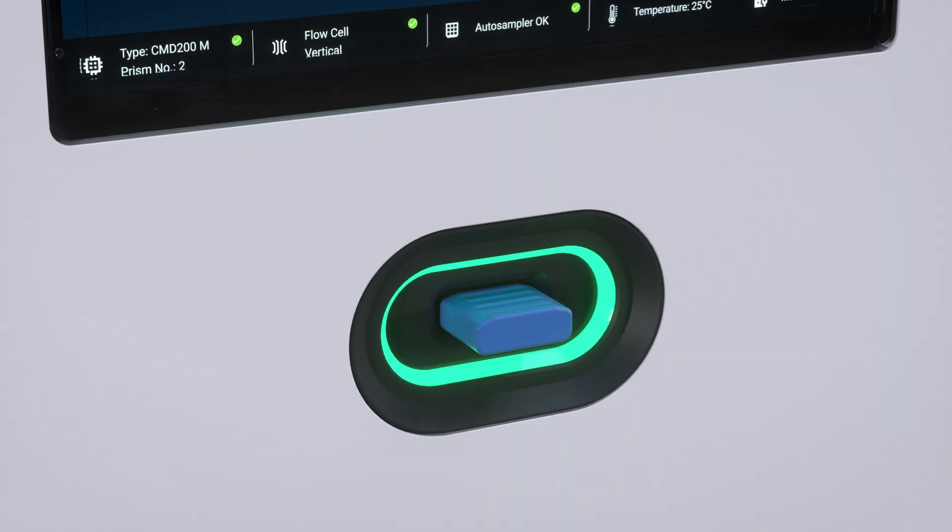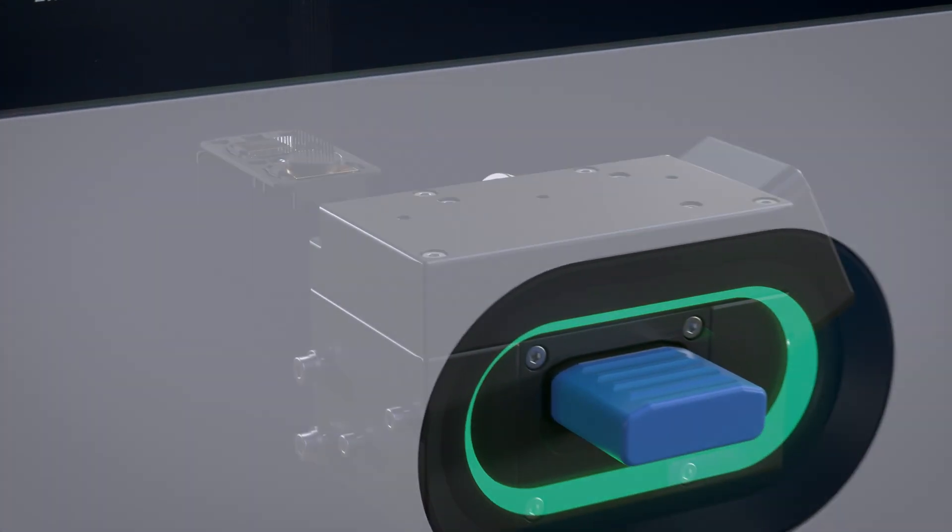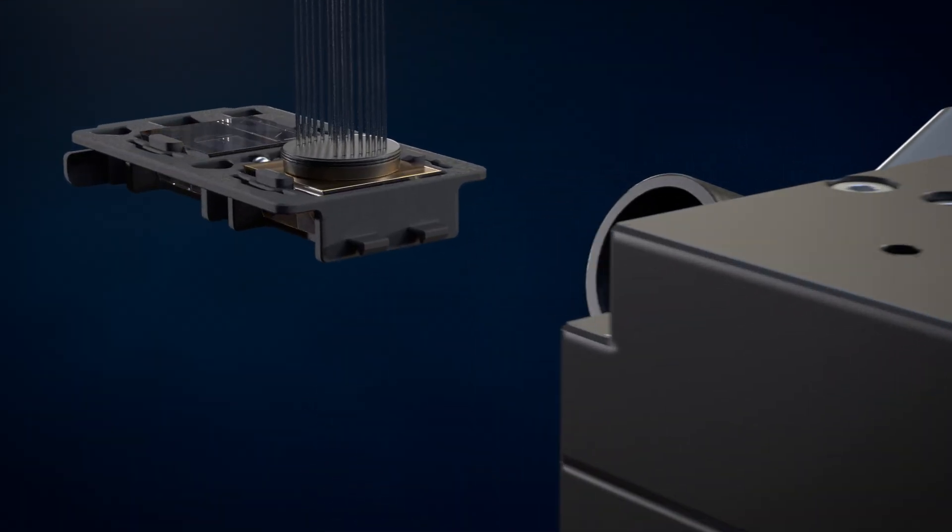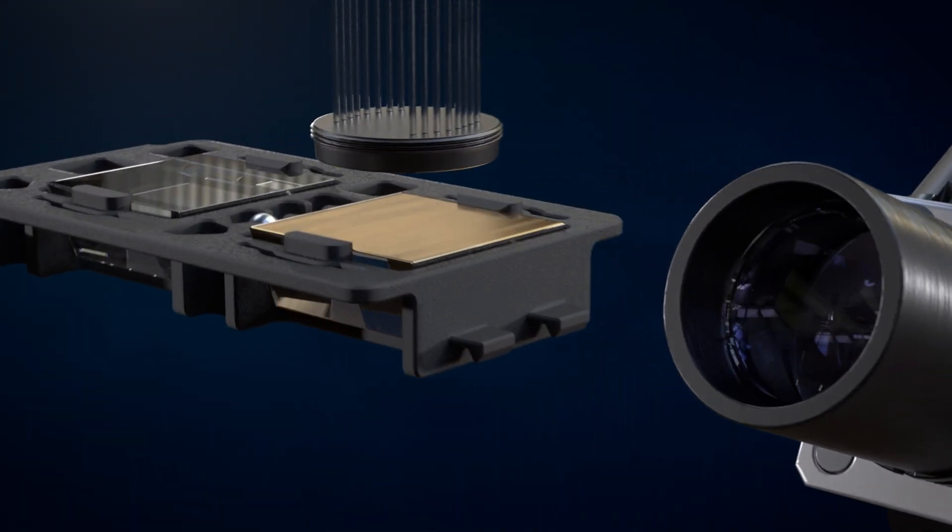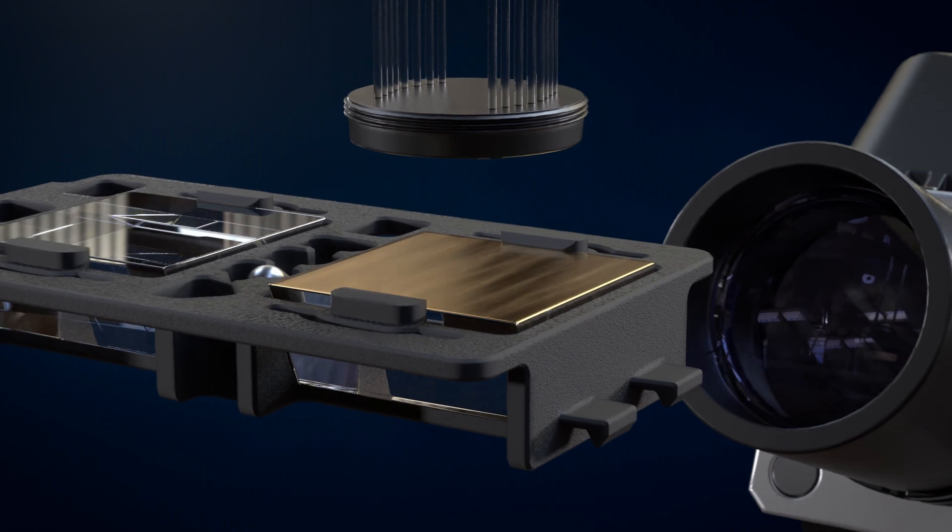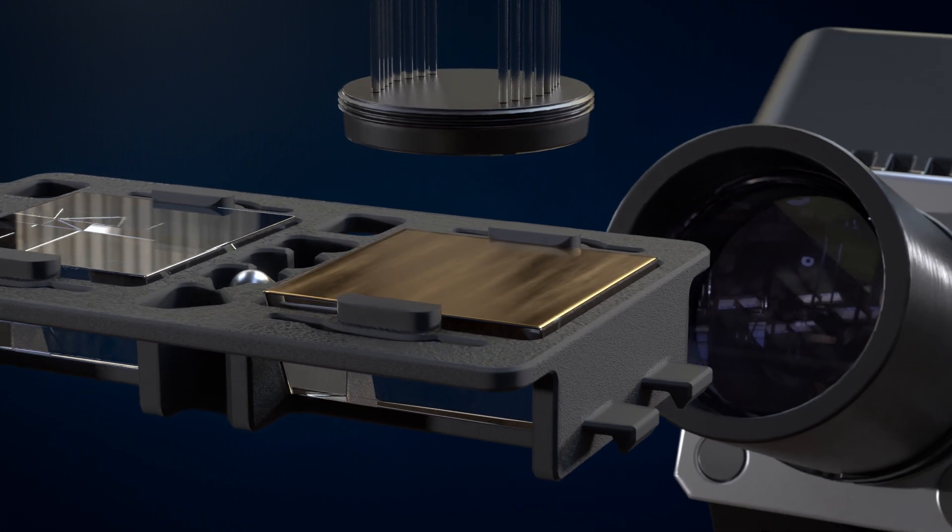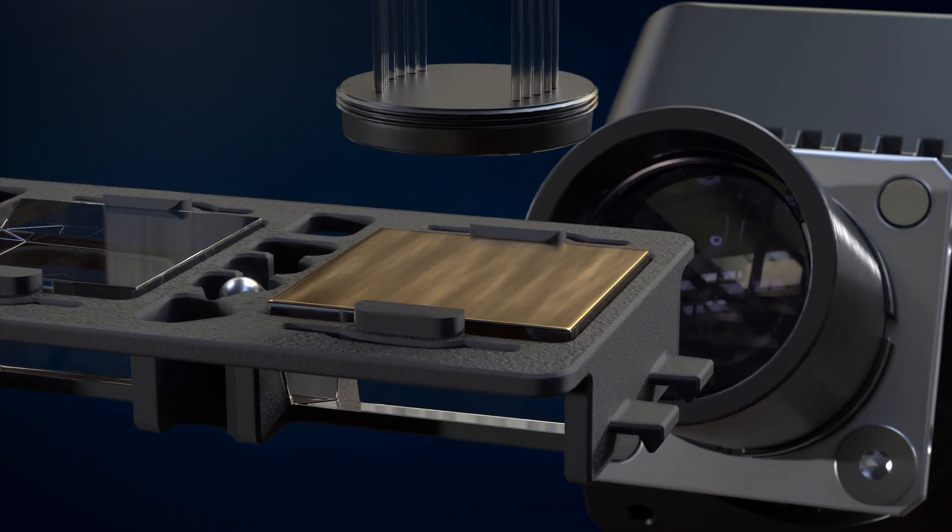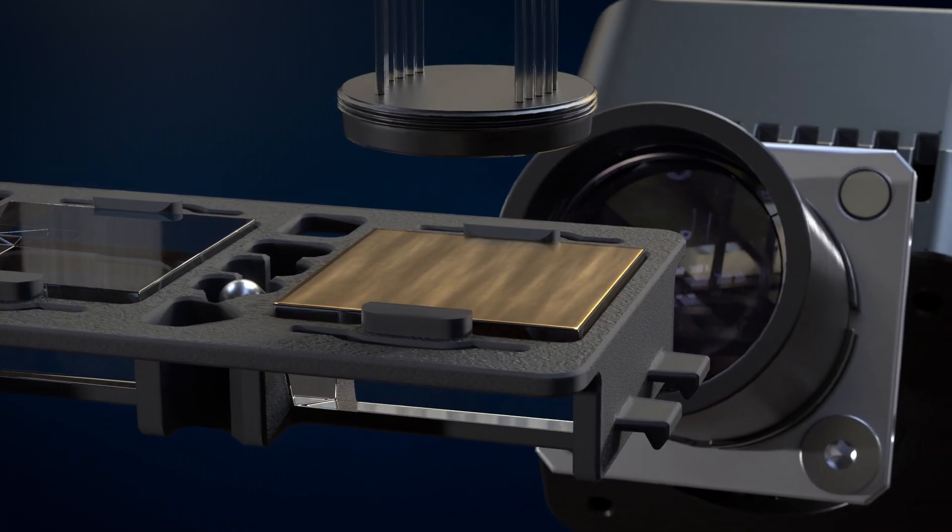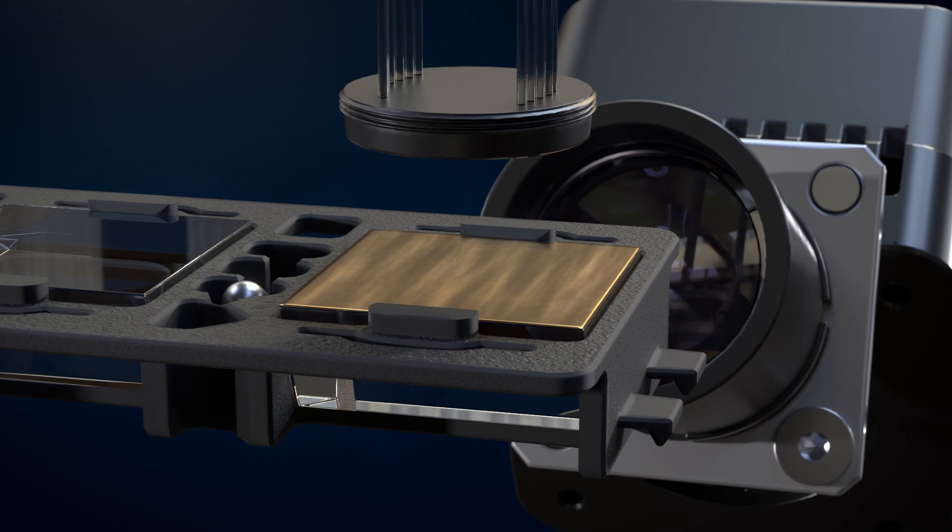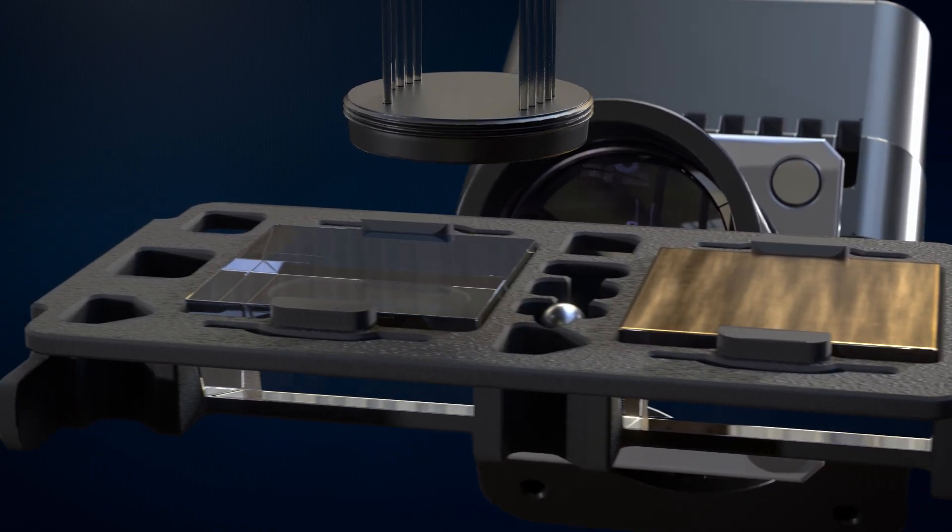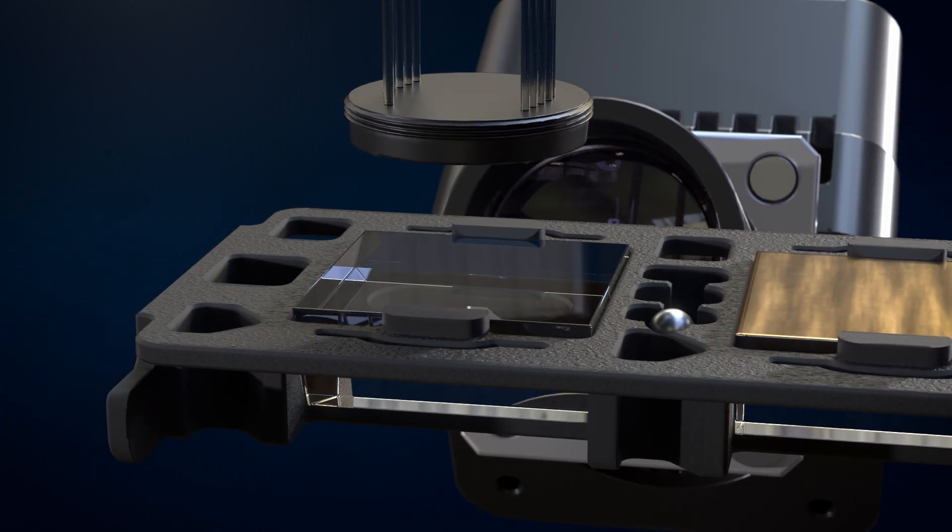Bruker's new dual-prism sensor combines two sensor surfaces within a single consumable. The active prism is used for the real-time measurement of samples and is available in a broad variety of surface chemistries.